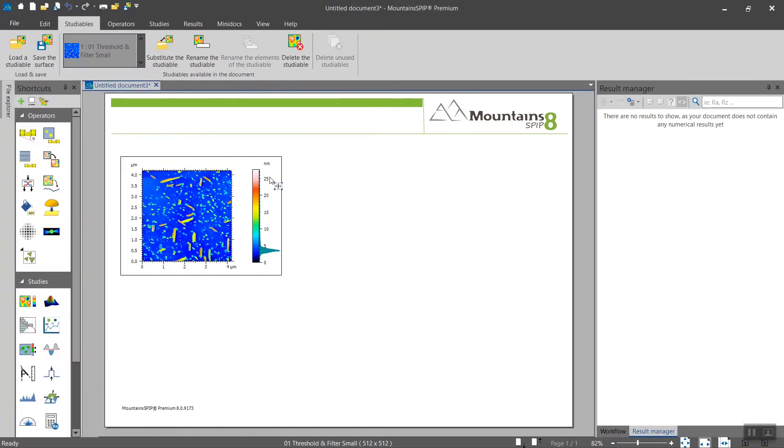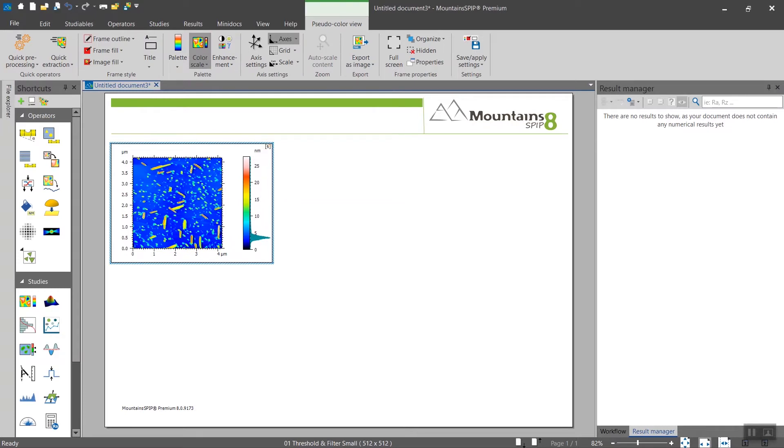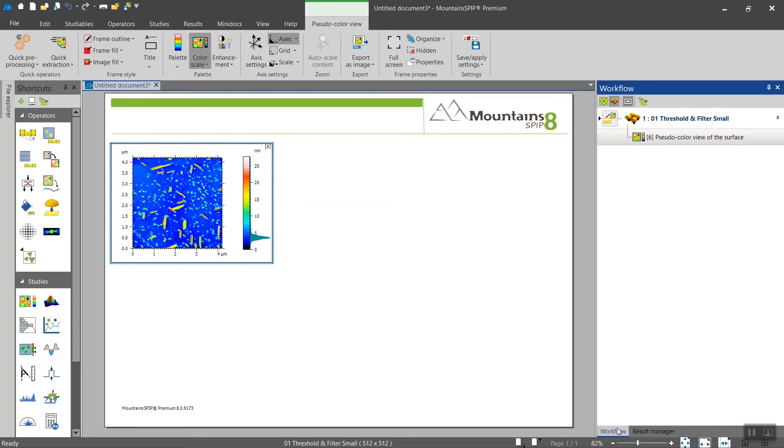As always in Mountain Speed, when you want to apply a study you select your studyables either directly on the document or from the workflow.